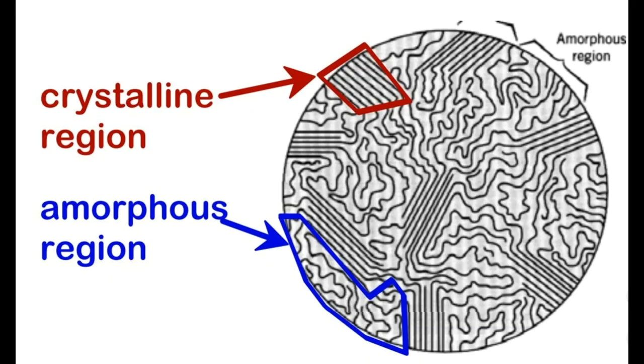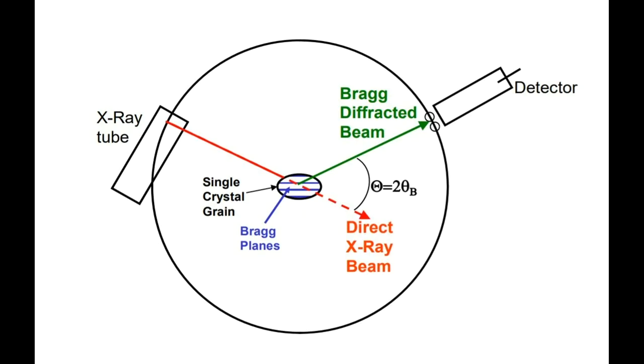Materials are often classified as crystalline, semicrystalline, or amorphous. Most polymers are semicrystalline. This means a fraction of the material is amorphous and lacks order in arrangements of polymer chains, while the remainder of the material exhibits parallel, well-ordered chains that define crystalline regions. There are several methods for determining the degree of crystallinity in a polymer.